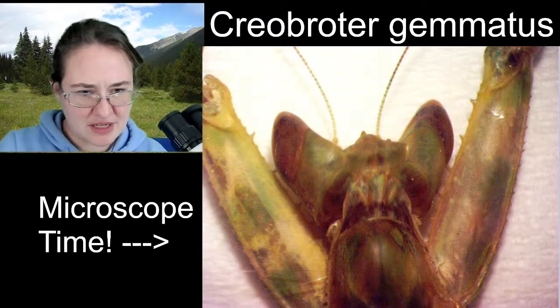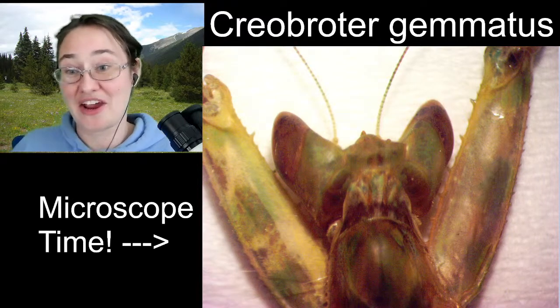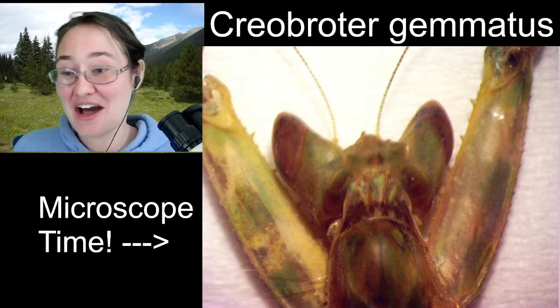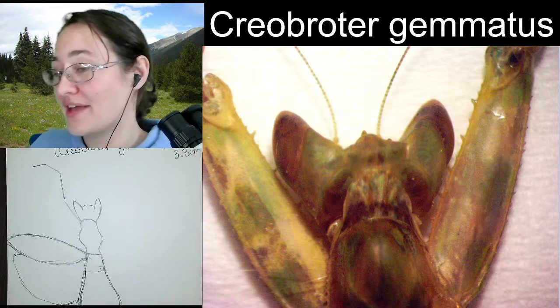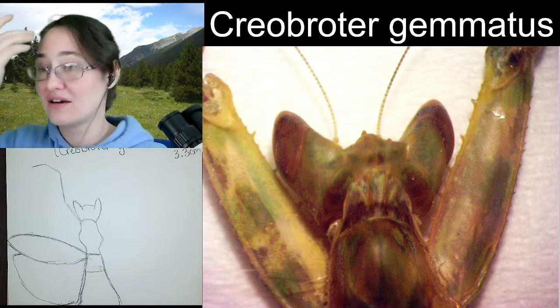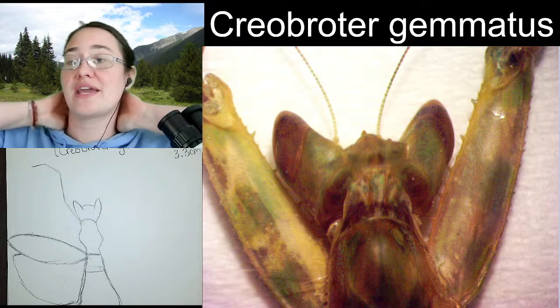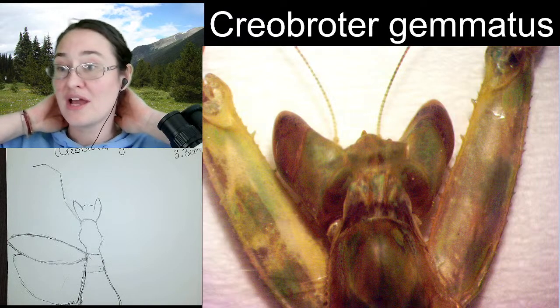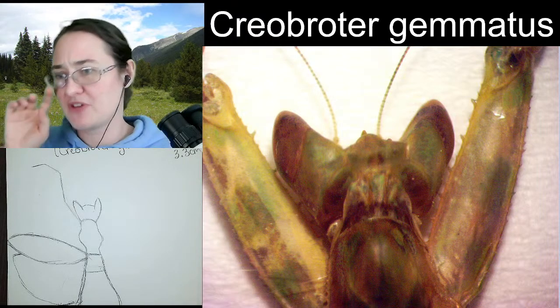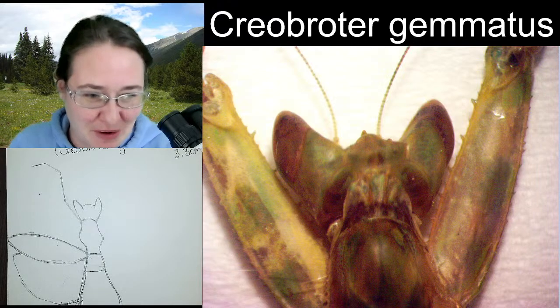The pronotum is like a lidded vase. So it's long. Oh, so the first really long segment is the coxa here. Yes! The raptorial front legs of praying mantids are uniquely adapted in that the coxa is the first elongated segment, which also means that the trochanter is super big and obvious. When we're drawing that front leg, it'll be cool because I'll be able to point out some special parts.